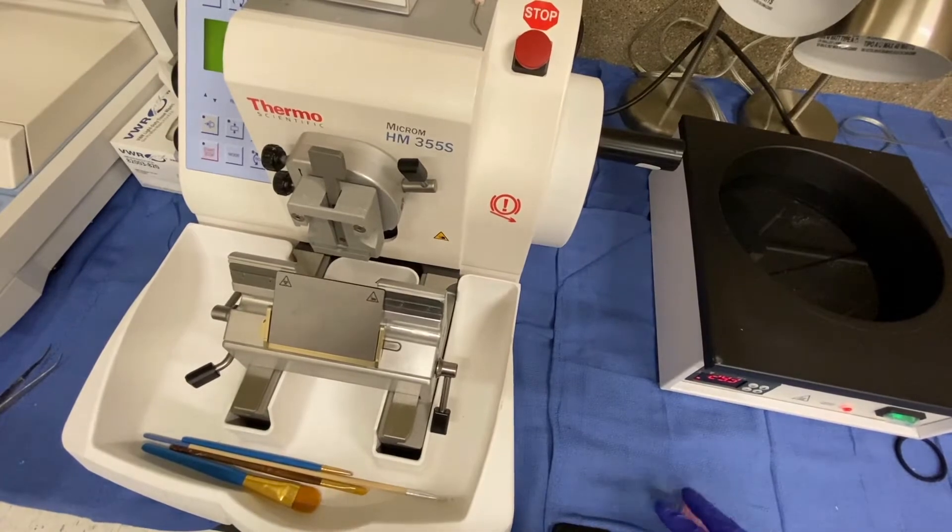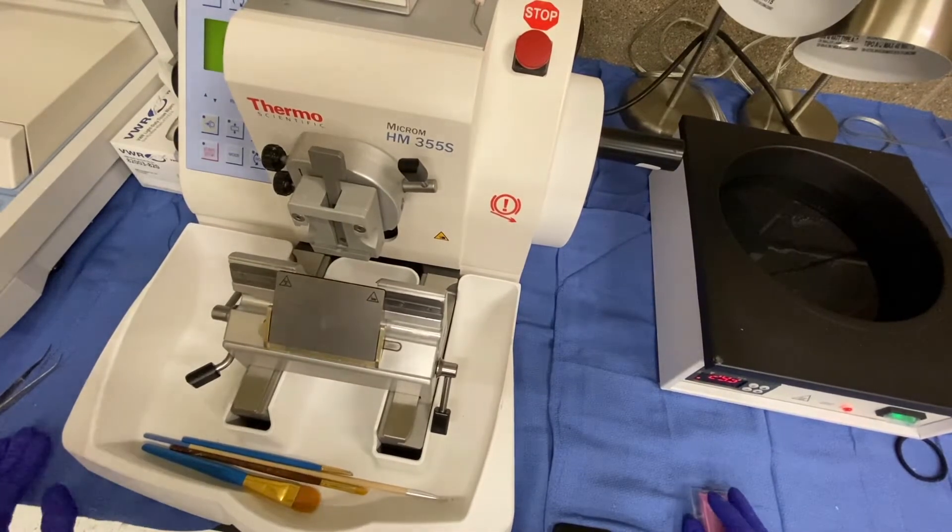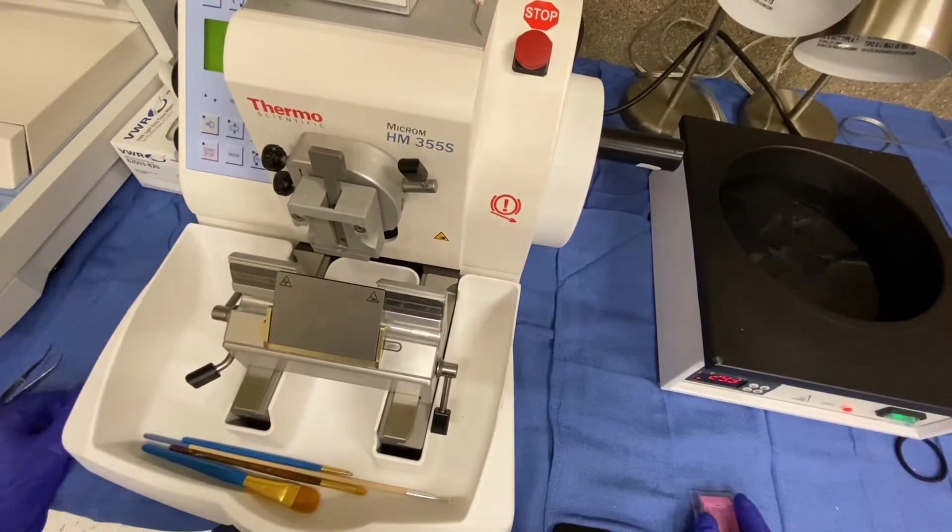Hello, this is Roseanne Vitale and I will be covering the basic features of the microtome that we have in our laboratory, how to use it, and what you will need to do for the lab.